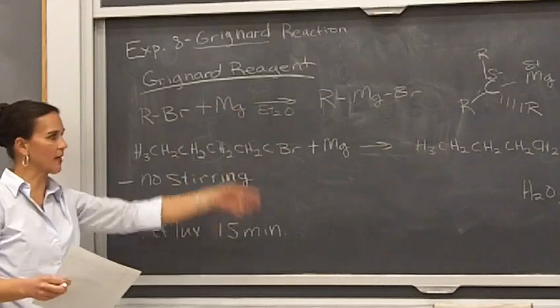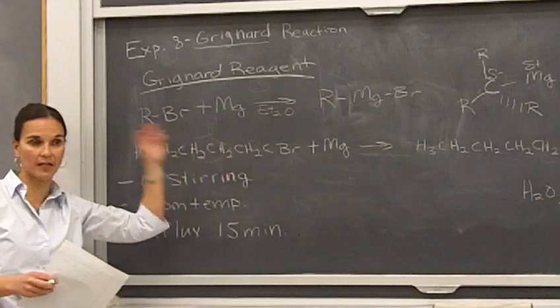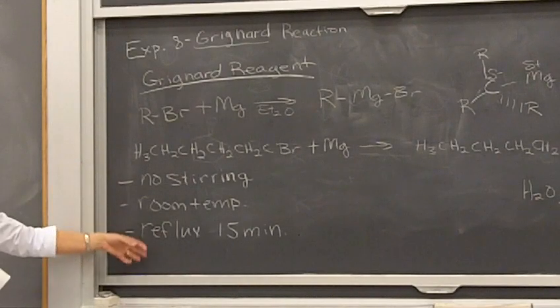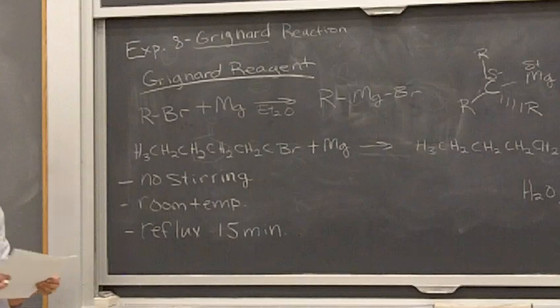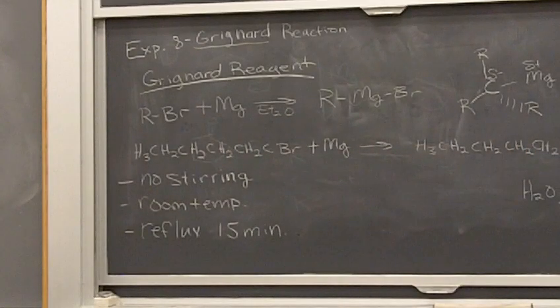And remember, to set up this reaction, we've used the anhydrous ether, okay? This whole time we've used anhydrous ether. That is in the reagent hoods. There's bottles of anhydrous ether in the reagent hoods. Do not use the red can ether for this reaction, all right?